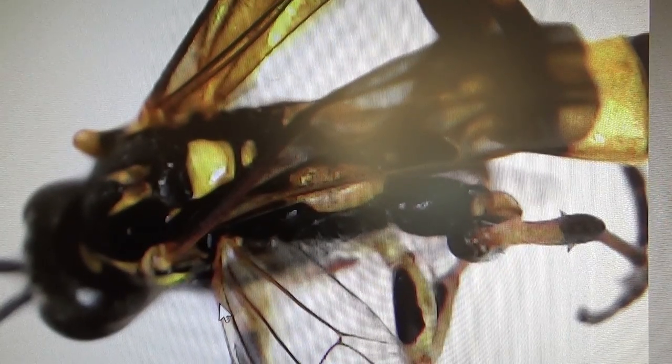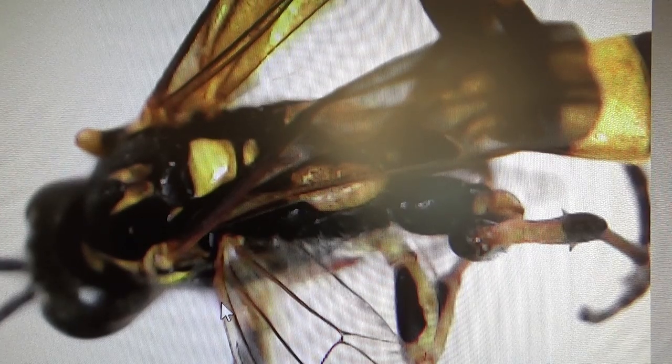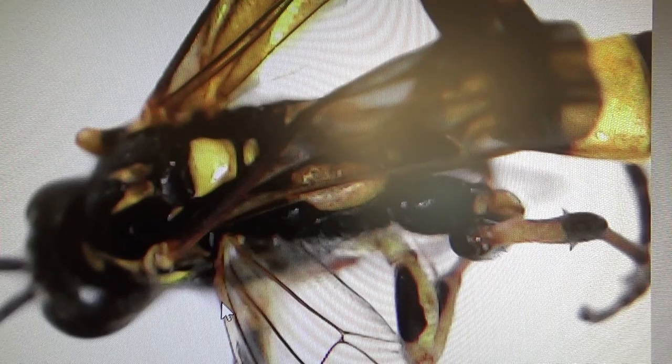Welcome to Mimi's Science Lab. Now this is using a microscope, and then I'll show you in real. It's always fun to look at things under the microscope - they're so much bigger, and you'll see so many details.